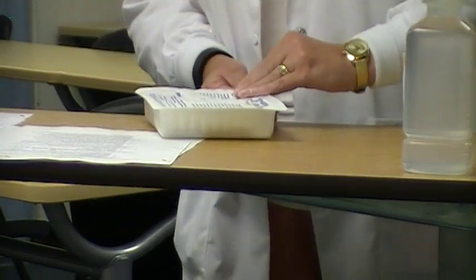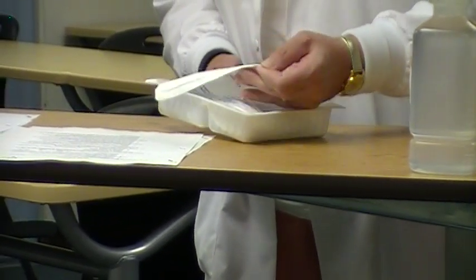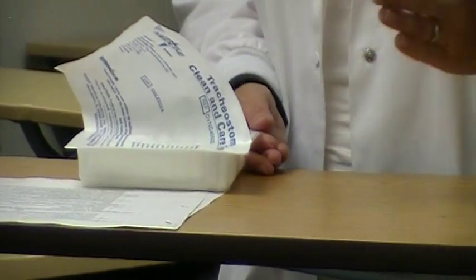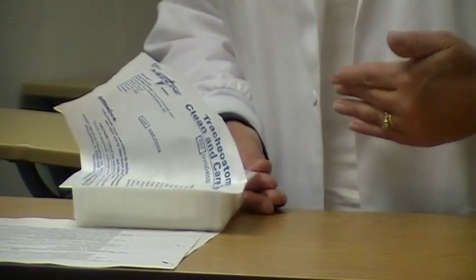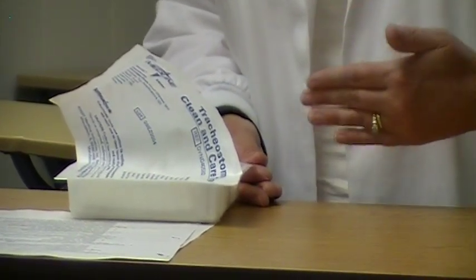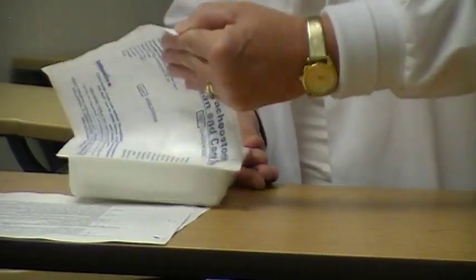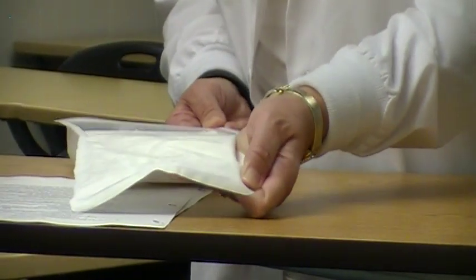Again, being careful not to contaminate. So again, just kind of slow, and as you see, my hand is moving backwards. It's not going to cross over anything that is inside this container because everything in this container is considered to be sterile. So as I'm going, my hand is moving away and not crossing over my sterile field. So I'm going to pull that back.